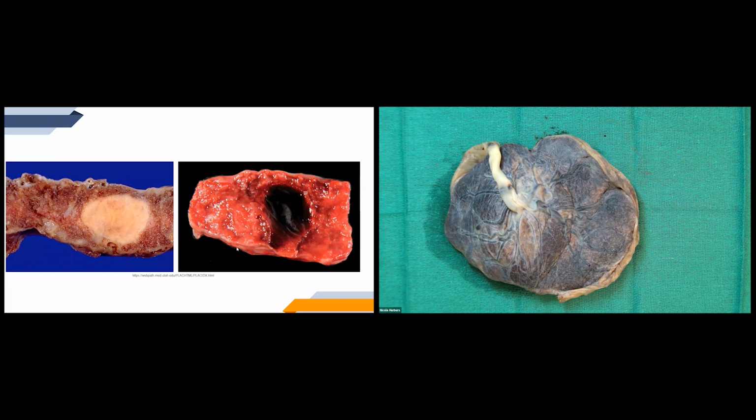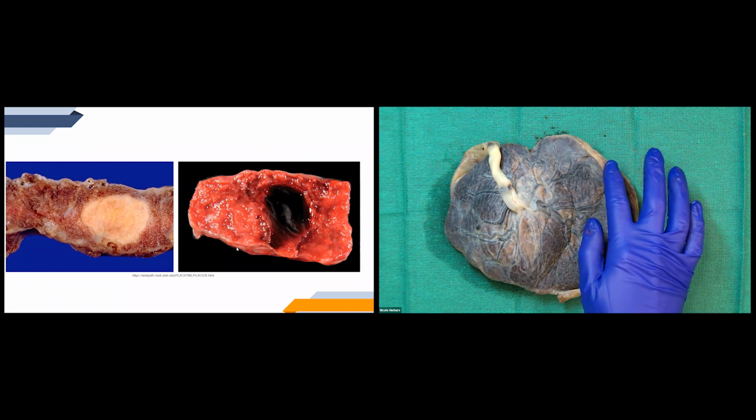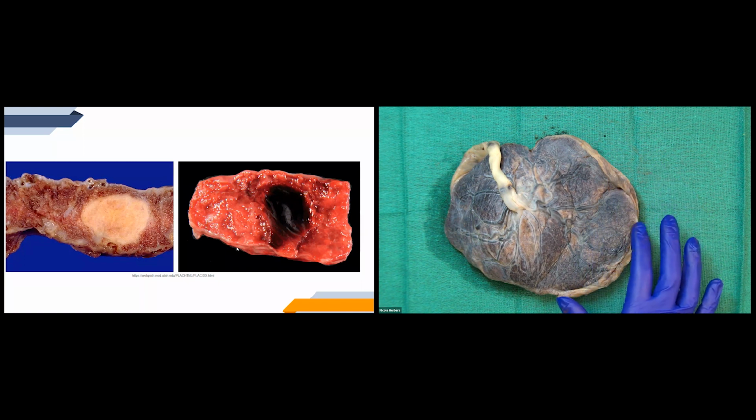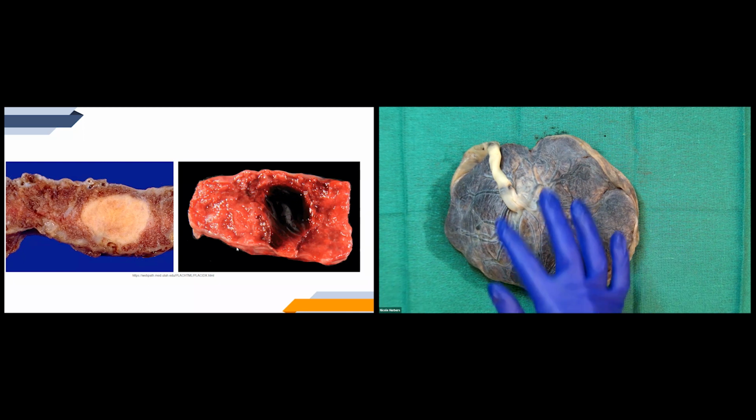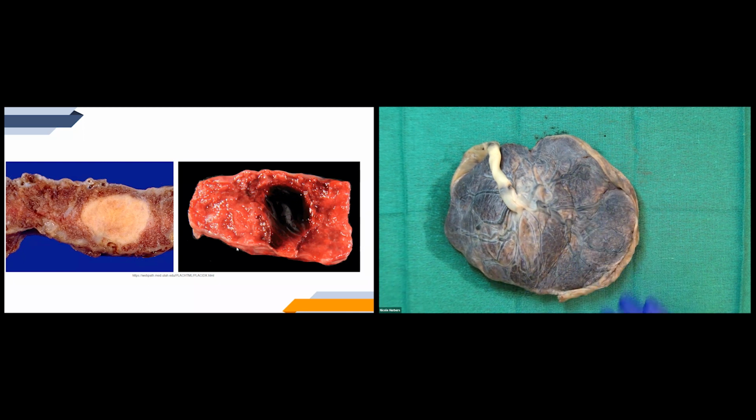The percentage of disc involved with the infarcts, the higher the percentage, the more clinically significant that would be. And as well, if they're located centrally, that's also more clinically significant than if they were located peripherally. Usually the edges of the placental disc are already a little bit more poorly perfused than the center of the disc. And this can then lead to growth restrictions. And if there's extensive involvement, this can actually lead to fetal death.